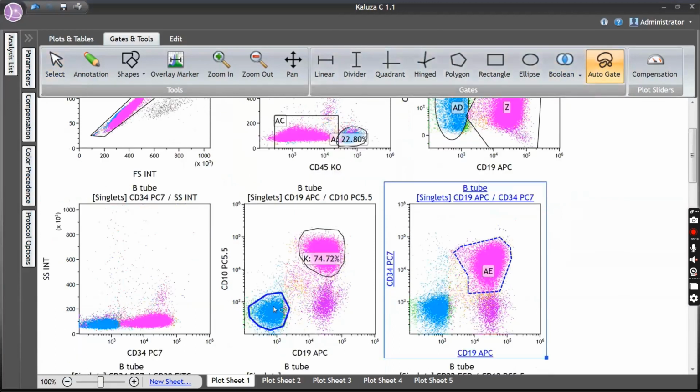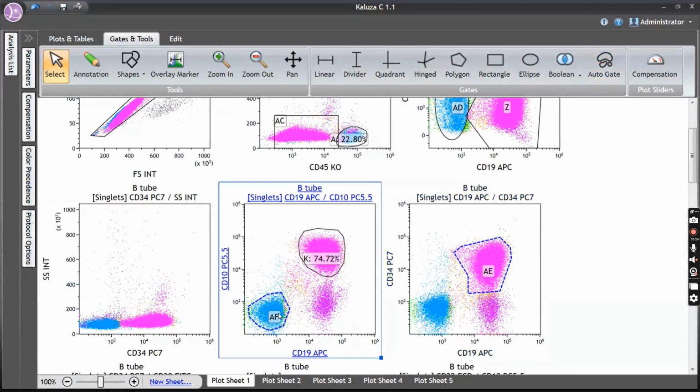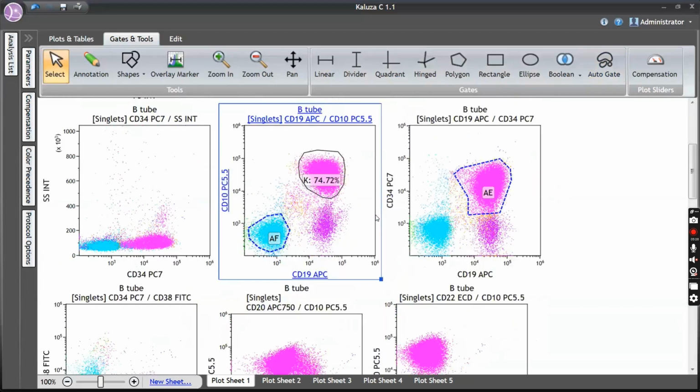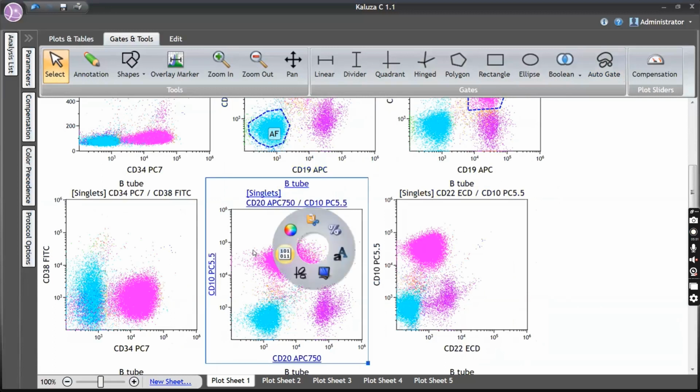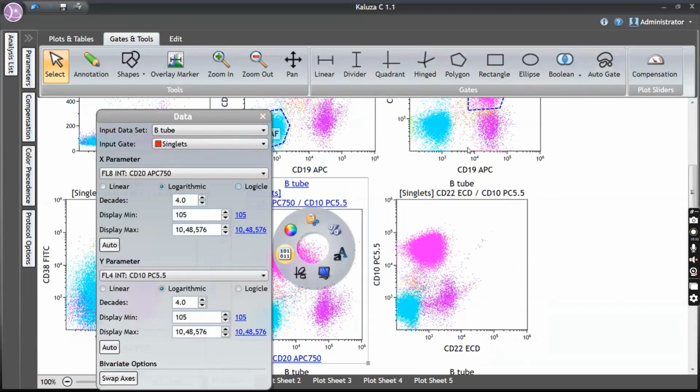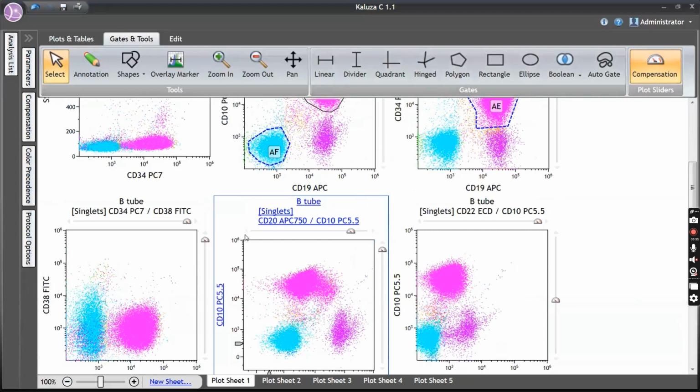So you need not draw the plot. The software itself draws a gate or a region around that particular population. Now, yesterday I told you what is region and gate, but though I may be using it interchangeably, let me tell you what is region and what is gate.